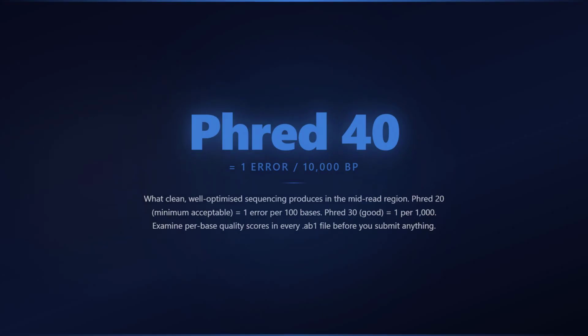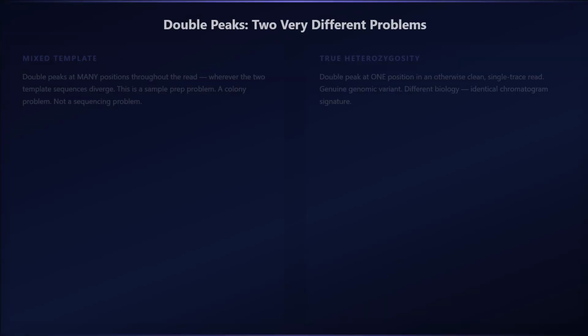A smooth Phred profile that rises quickly from the primer region, plateaus through the mid-read, and falls gradually at the end is what clean chemistry produces. A jagged profile, an early drop-off, or a Phred collapse after a homopolymer run each indicate a specific upstream problem.